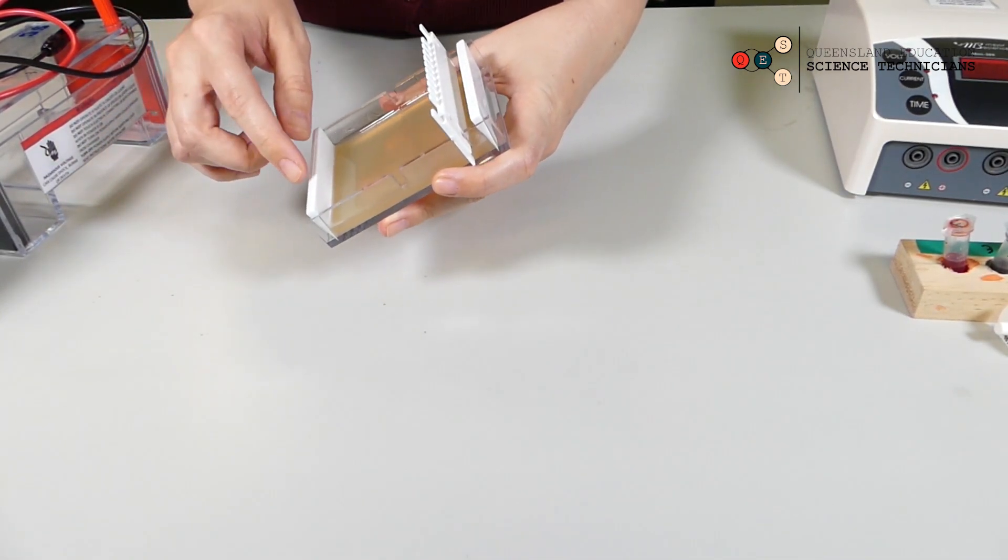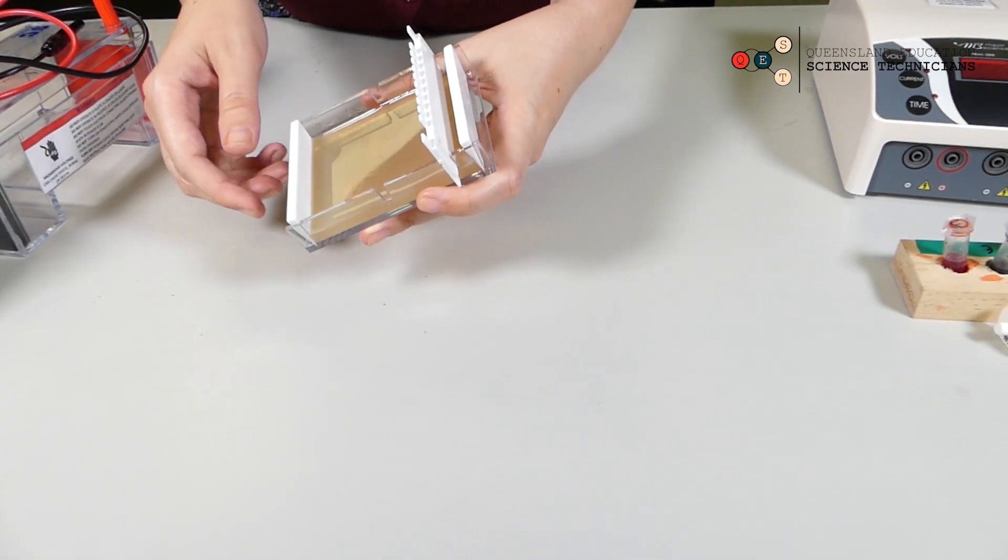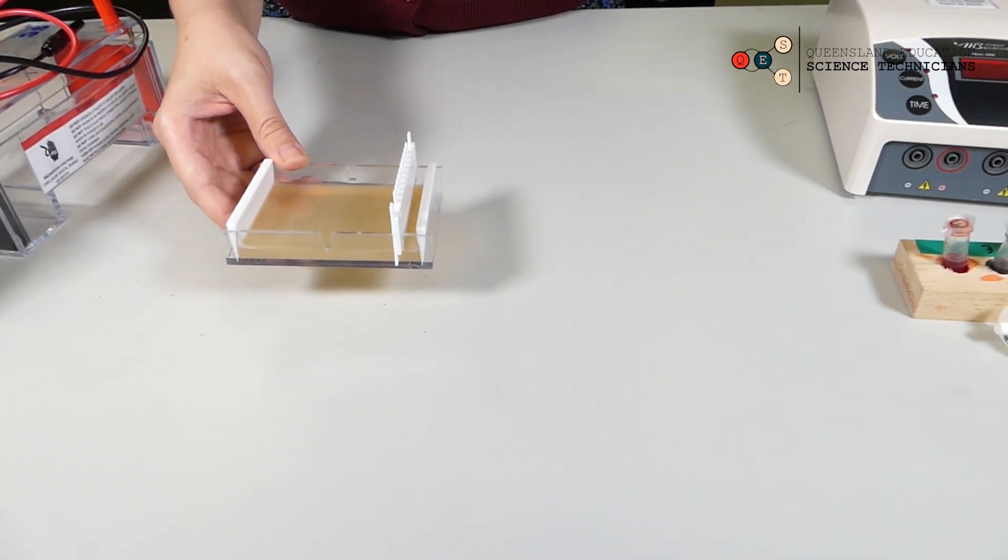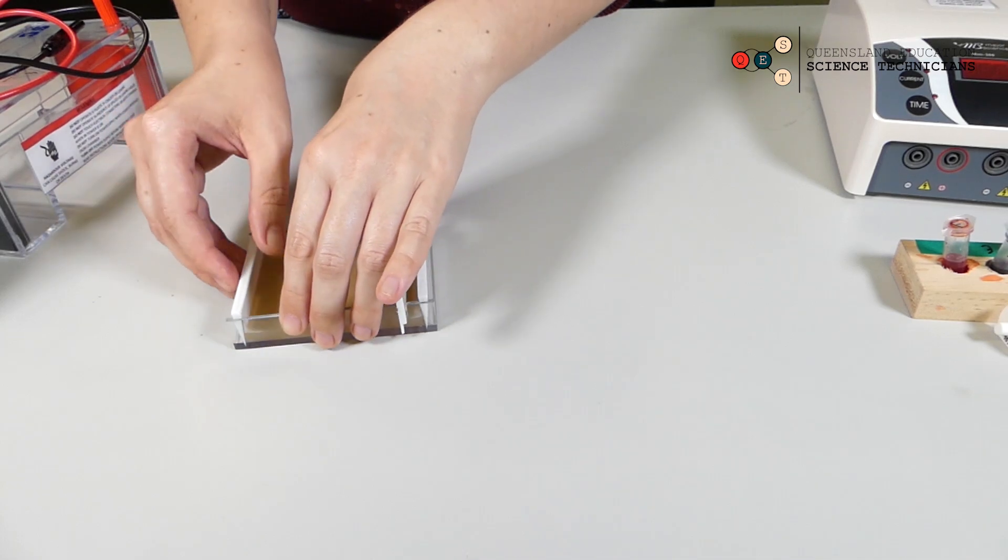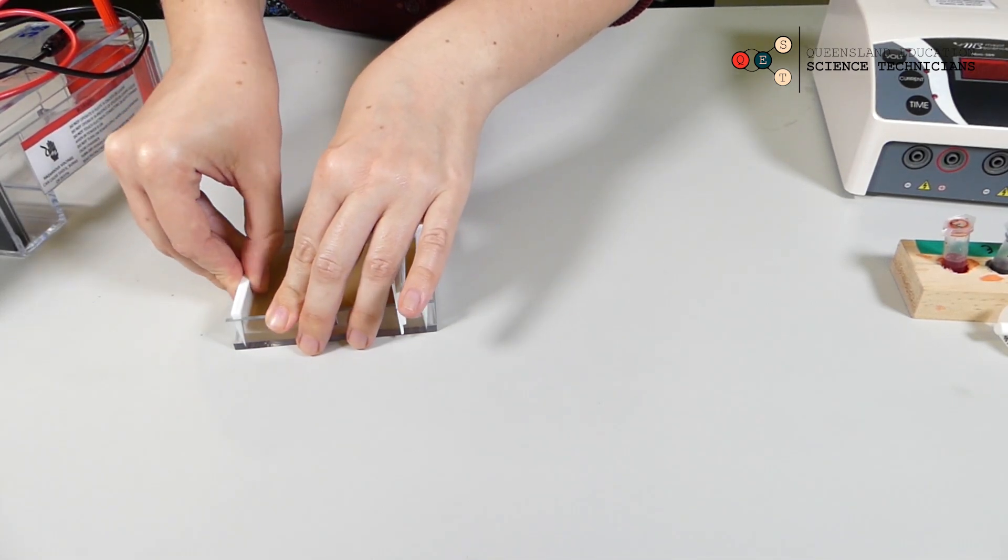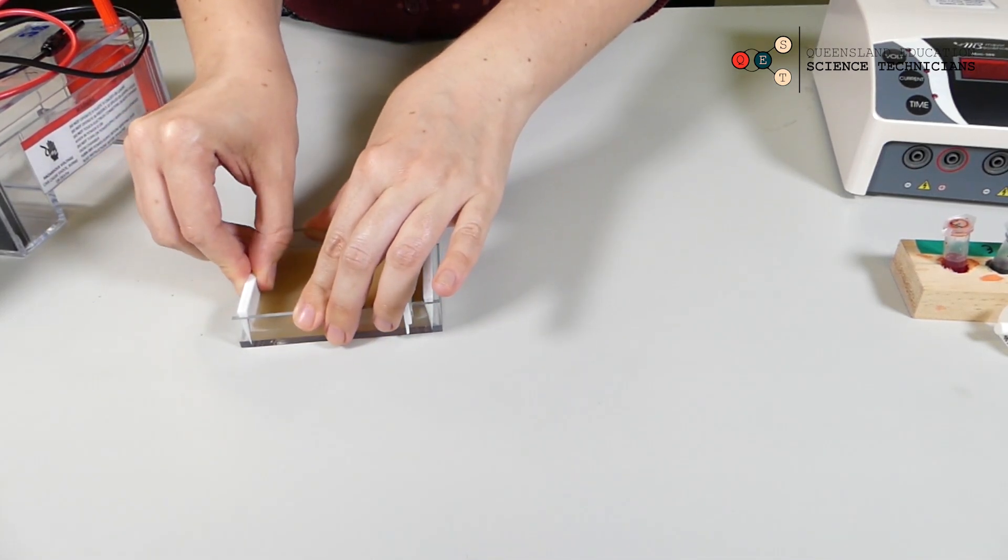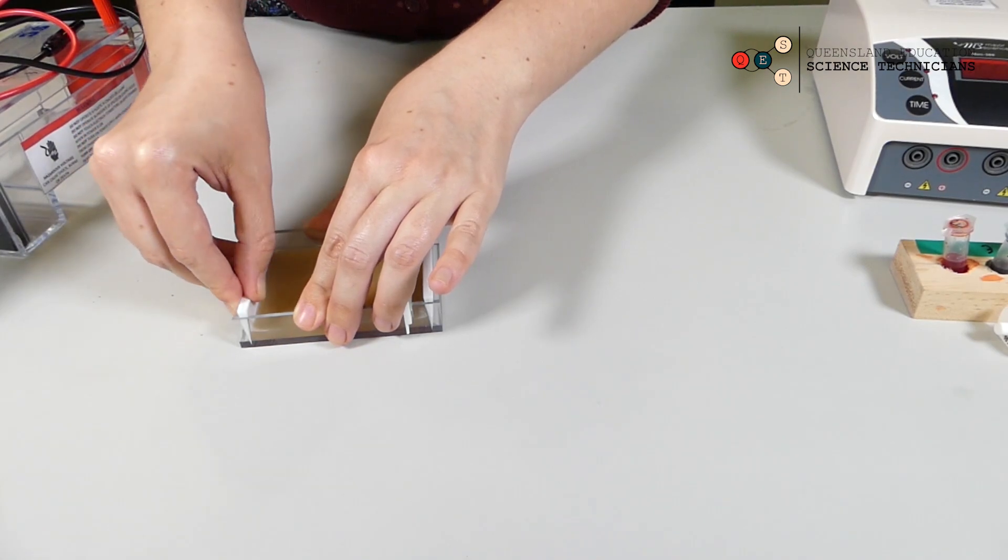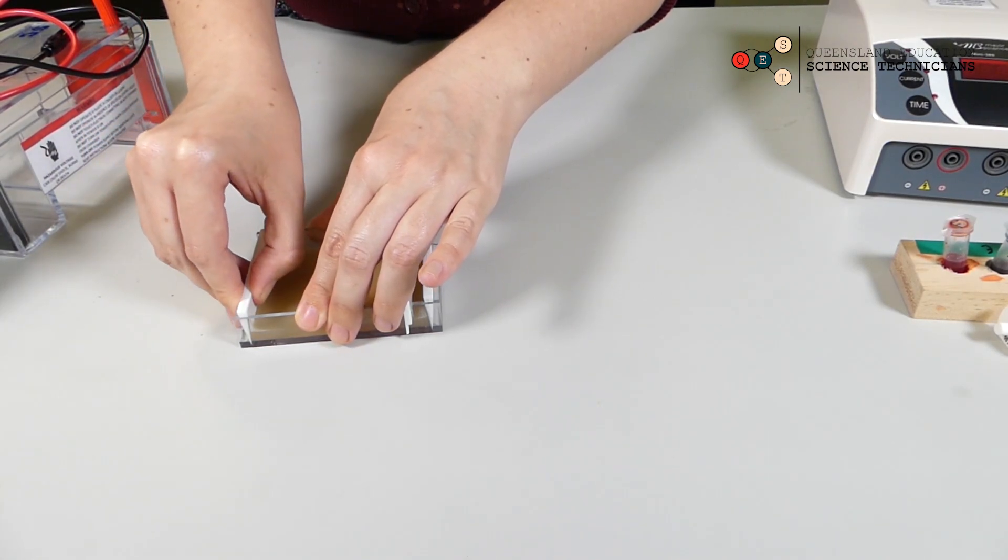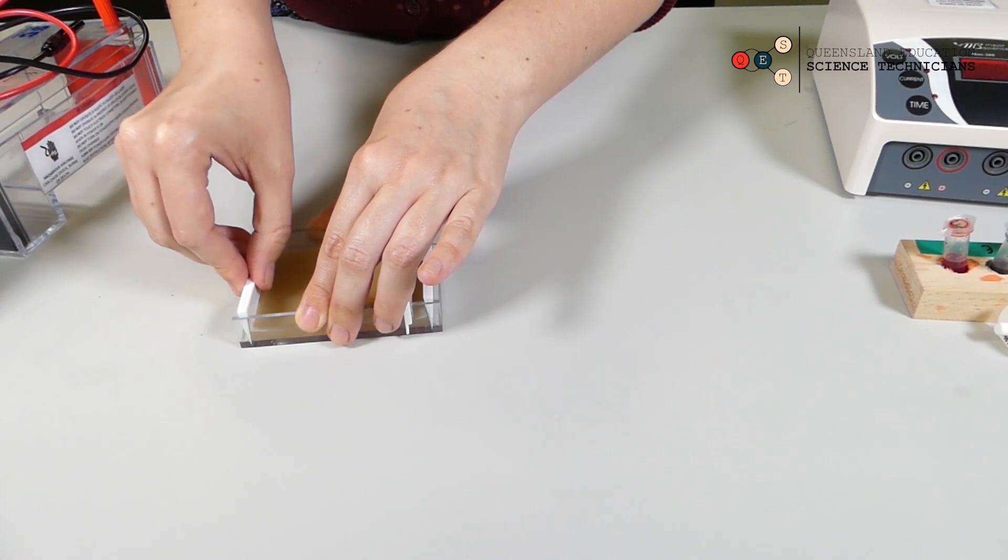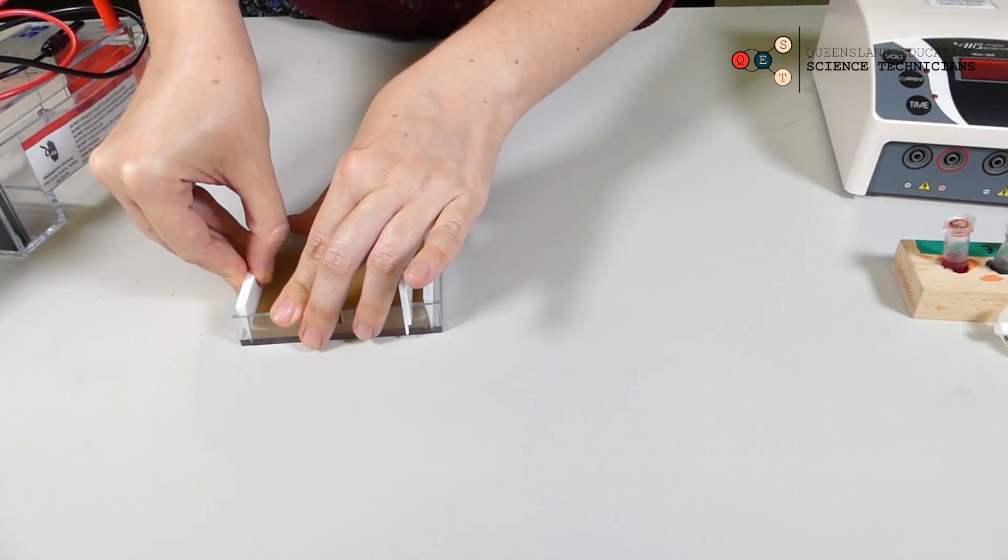We need to take out the two ends and the comb so that all that's left in this is gel. Just give it a little wiggle. You don't want to break the agar. You don't want to break that seal between the end and the agar, and then just pull it up gently.